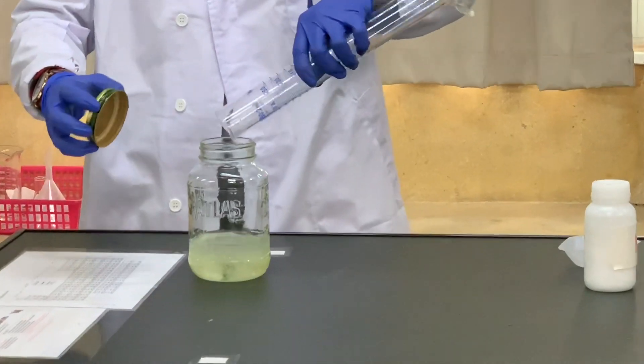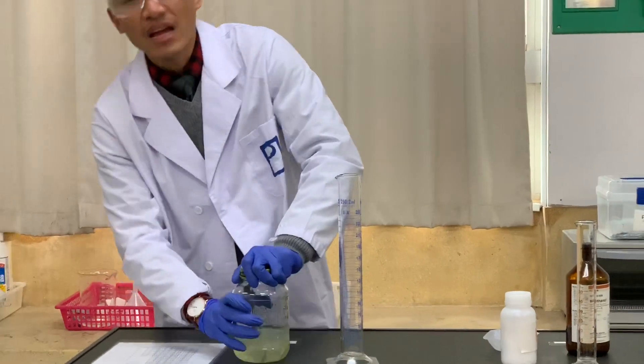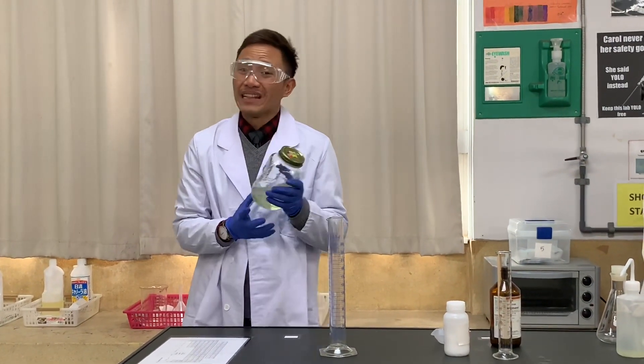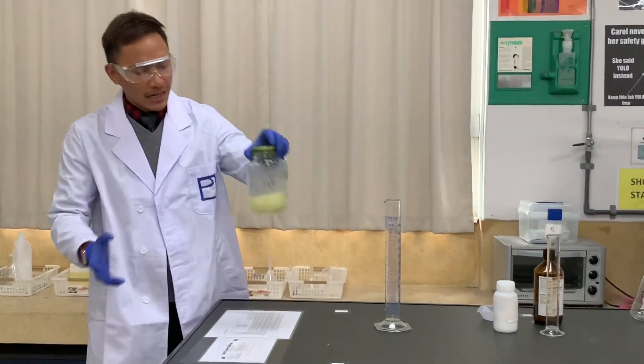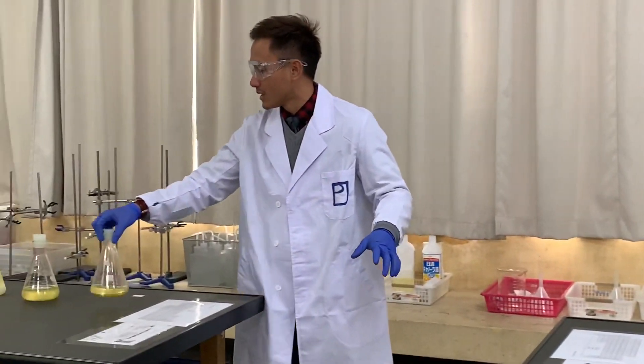When you add them, they should produce some bubbling inside — that's emulsion, don't worry about it, it's completely normal. Add all of them, then seal it. This is the challenging part: you're going to have to shake this for at least 10 minutes. After that, leave it until the layers separate themselves.